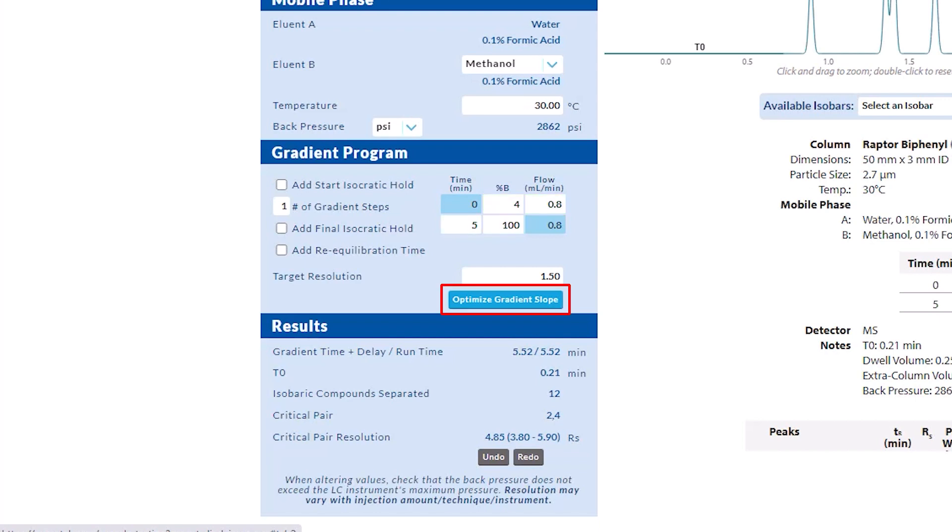You also have the optimize gradient slope button. This button will automatically calculate a new gradient to increase or decrease the resolution of the closest critical pair toward the target resolution. In our example, we'll set the target resolution to 2 and click the button.